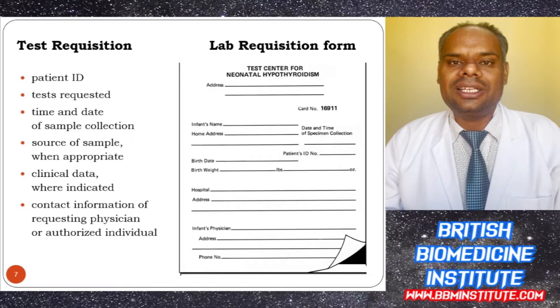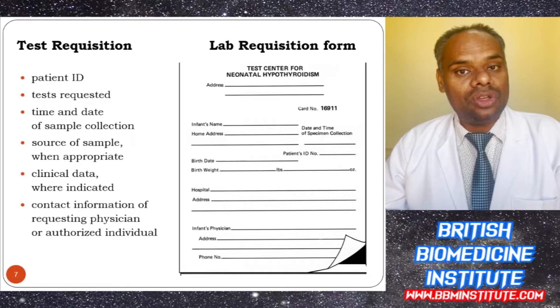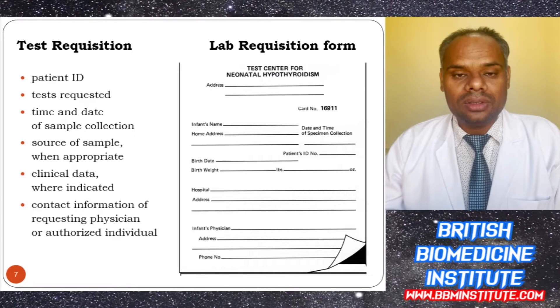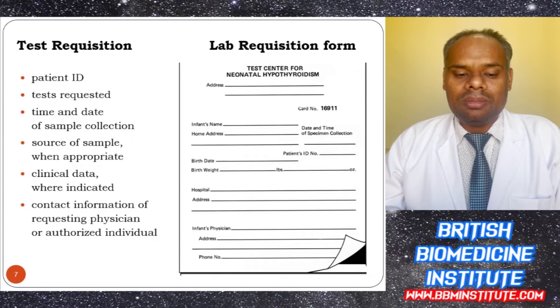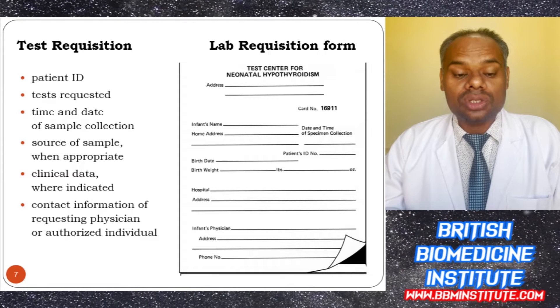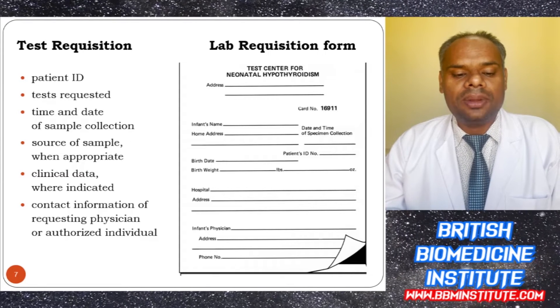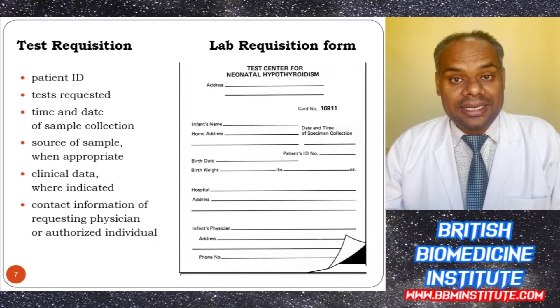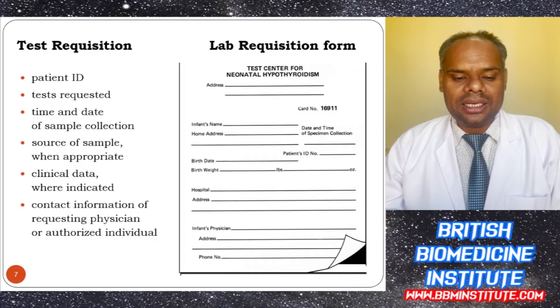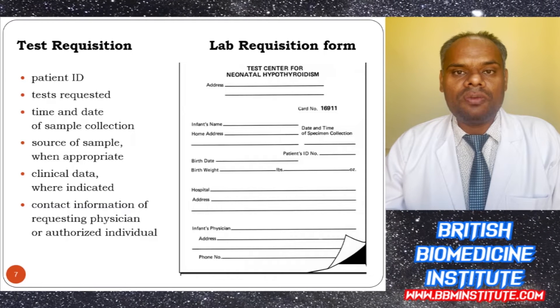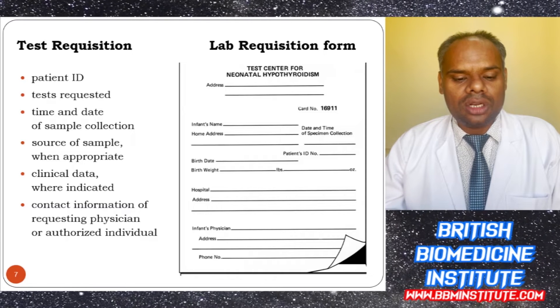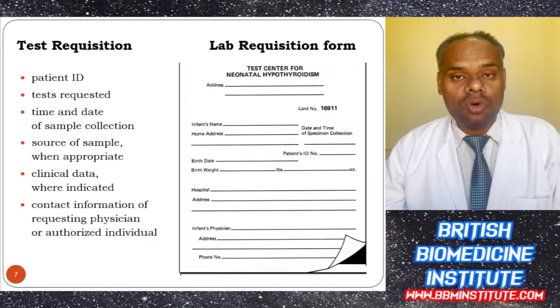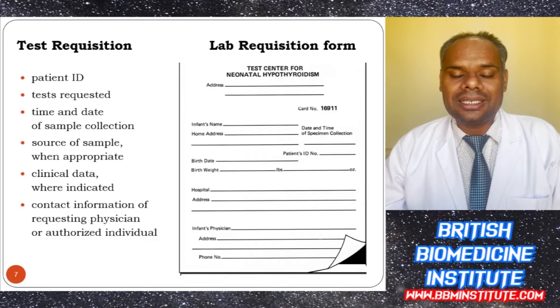In order to get the best result, we must fill the test requisition with the patient ID, test required, date and time of sample collection, source of sample where appropriate, clinical data where indicated, and contact information of the requesting physician or authorized individual. We have to fill the lab requisition form with correct details.